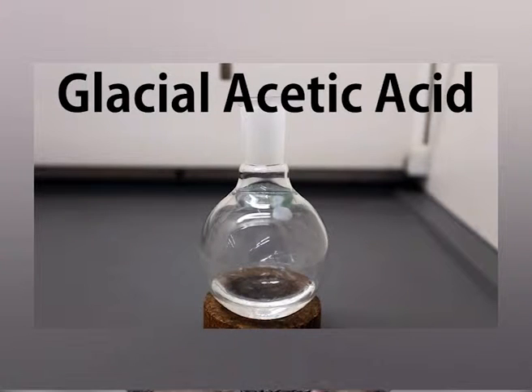Solution B, or the second solution, is a mixture of glacial acetic acid, 10 ml, and methanol, 90 ml. The third solution, or solution C, also contains a mixture of glacial acetic acid around 5 ml and methanol around 90 ml, but in a different proportion.